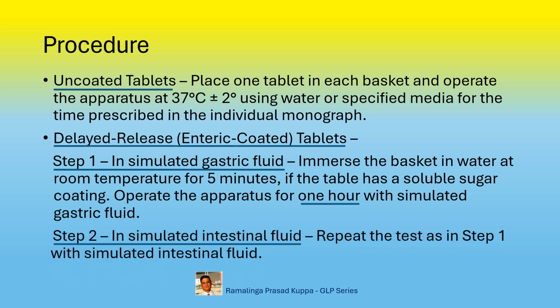Step 2 in simulated intestinal fluid. Repeat the test as in step 1 with simulated intestinal fluid. In this step 2, the test is carried out with buffer, which is a simulated intestinal fluid. Here the disintegration must be complete. Acceptance criteria are the same as in the uncoated tablets.